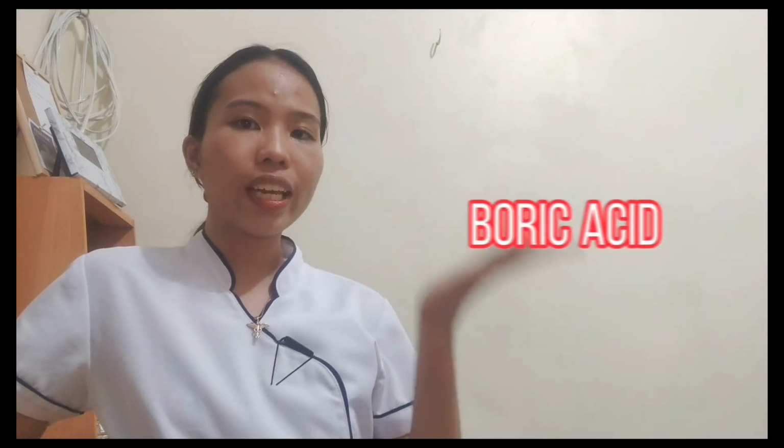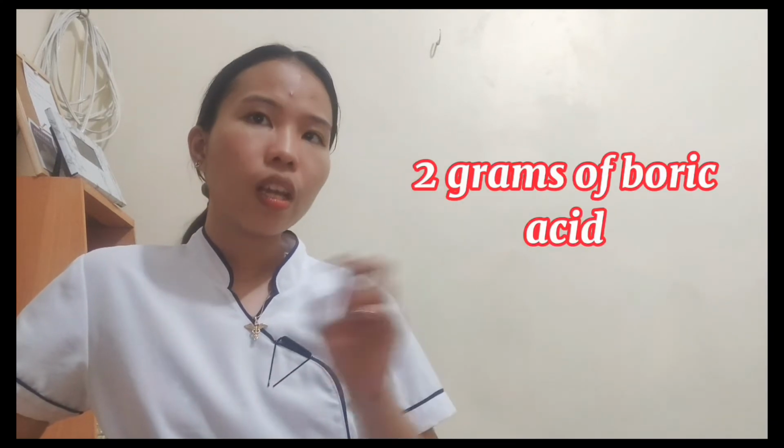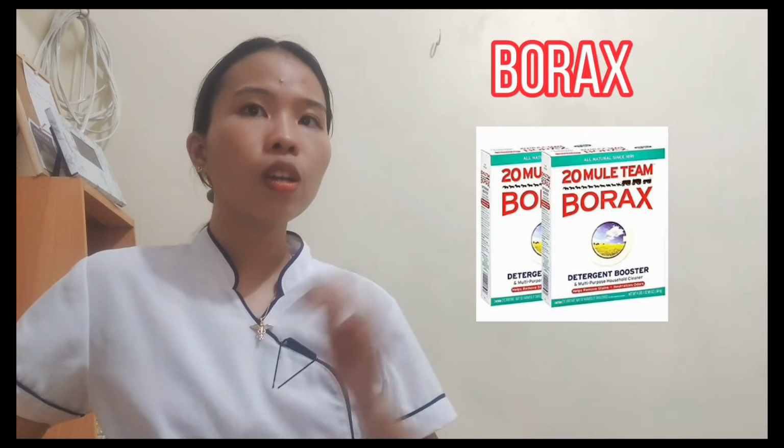Reagents. I will be discussing the reagents of boric acid. In boric acid reagents, first that you need is 2 grams of boric acid. Additionally, boric acid is low in toxins if eaten or if it contacts skin. However, in the form of borax, pwede siyang maging corrosive to the eye. Borax can also be irritating to the skin. People who have eaten boric acid have experienced vomiting, stomach aches, and diarrhea.